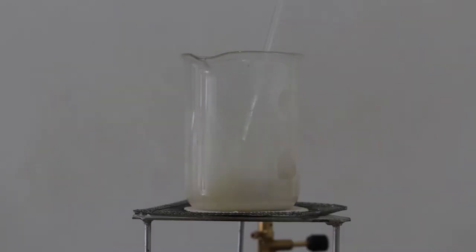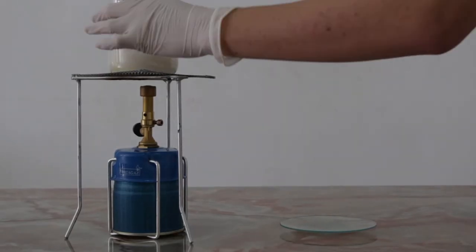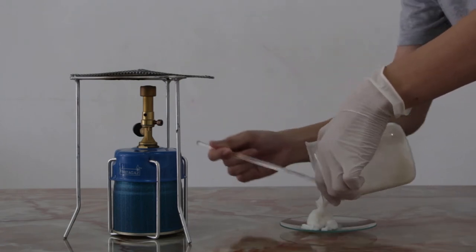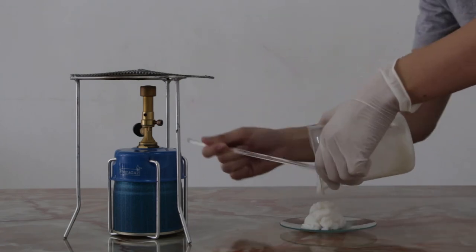When calcium acetate crashes out of solution, the Bunsen burner is turned off and the beaker is allowed to cool. The content of the beaker is then transferred to a watch glass and allowed to air dry for about a day.